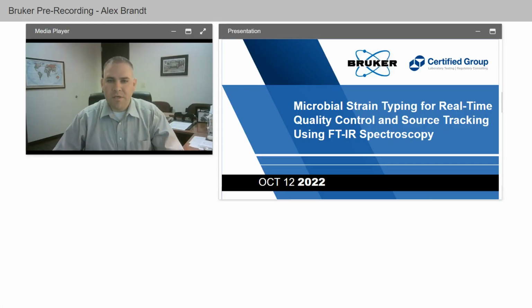Hello, everyone. Thank you for joining us today to talk about microbial strain typing for real-time quality control and source tracking using FT-IR spectroscopy. This is a collaborative presentation between Bruker and Certified Group today. We will be going over how to use some of the instrumentation from Bruker to accomplish microbial strain typing, which we do within our group here at Certified Group.